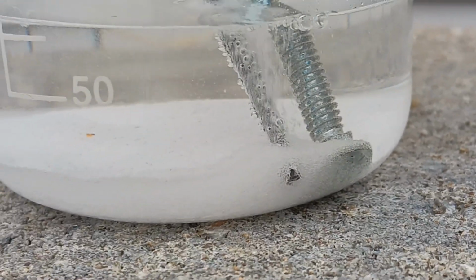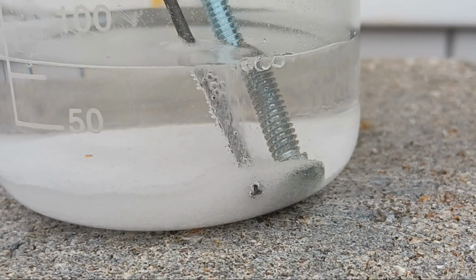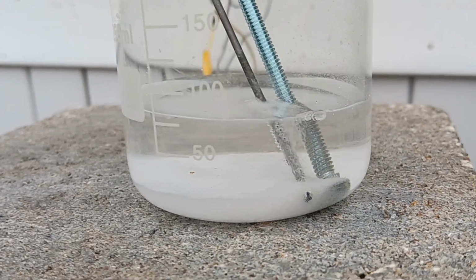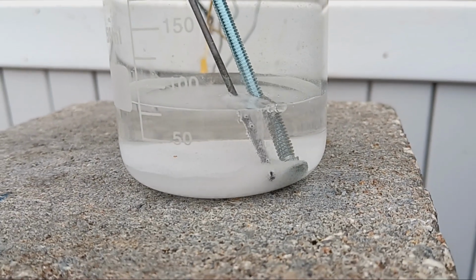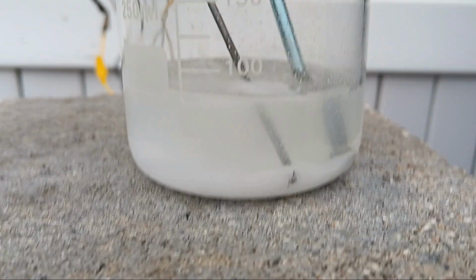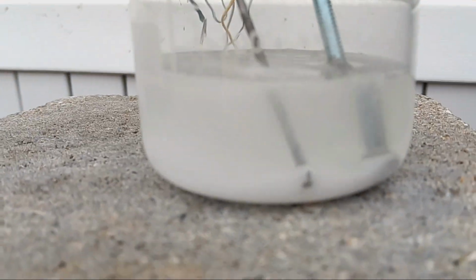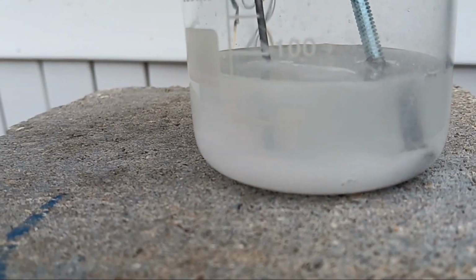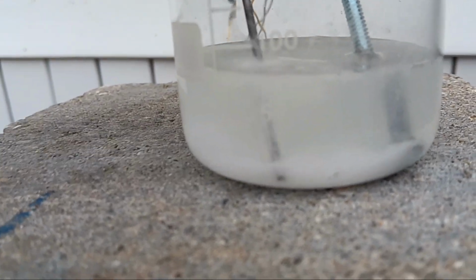This process is very beautiful. Many bubbles are produced. In fact, you can even hear the bubbles at some point. We will show that off later. What's interesting to note is that the metal begins to deform and swell. This is due to the metal corroding, and because we have the electrode at the right place, any hypochlorites that form will just oxidize the metal and be destroyed.